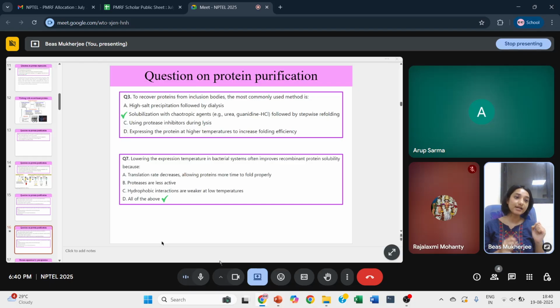Now the problem is that there will be small bits of DNA that will still be attached to your protein, because the protein binds to 4 to 6 base pairs of DNA. So these small DNA fragments will be bound to your protein. So later on, after purification, if you want to go for any DNA binding studies, you will not get good results because this DNA is already bound. So when you are adding DNA externally, the protein is not binding properly to this DNA, right?